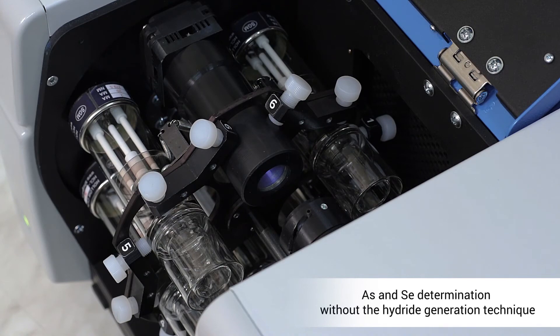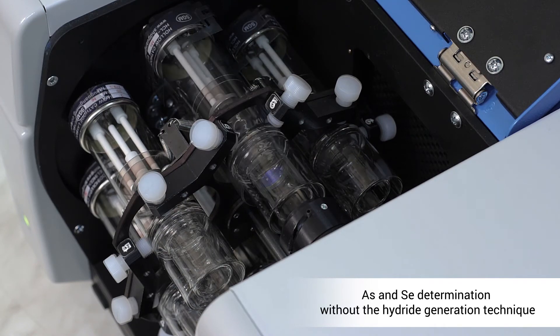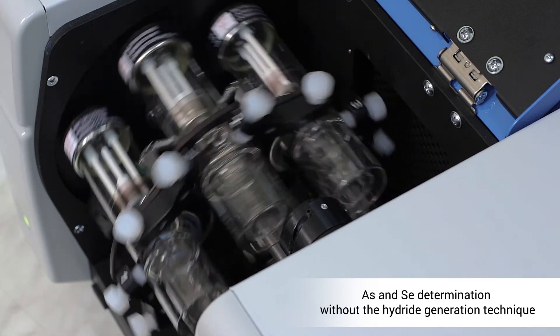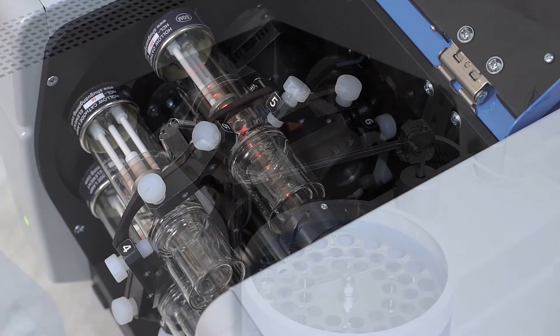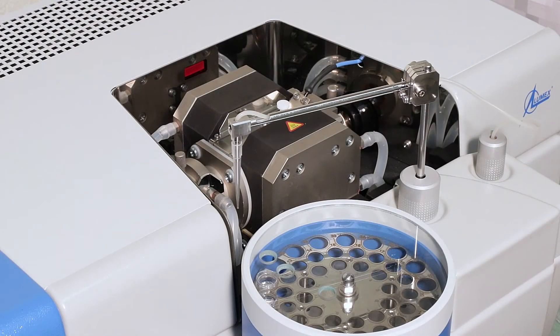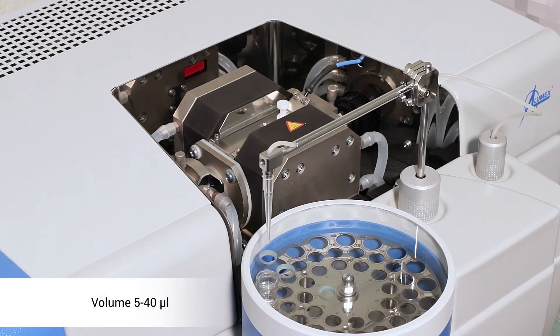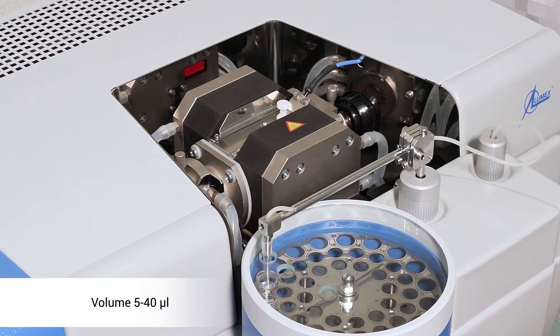Moreover, direct determination of arsenic and selenium at PPB and sub-PPB levels is achieved without the hydride generation technique. Analysis requires sample volume from 5 to 40 microliters.